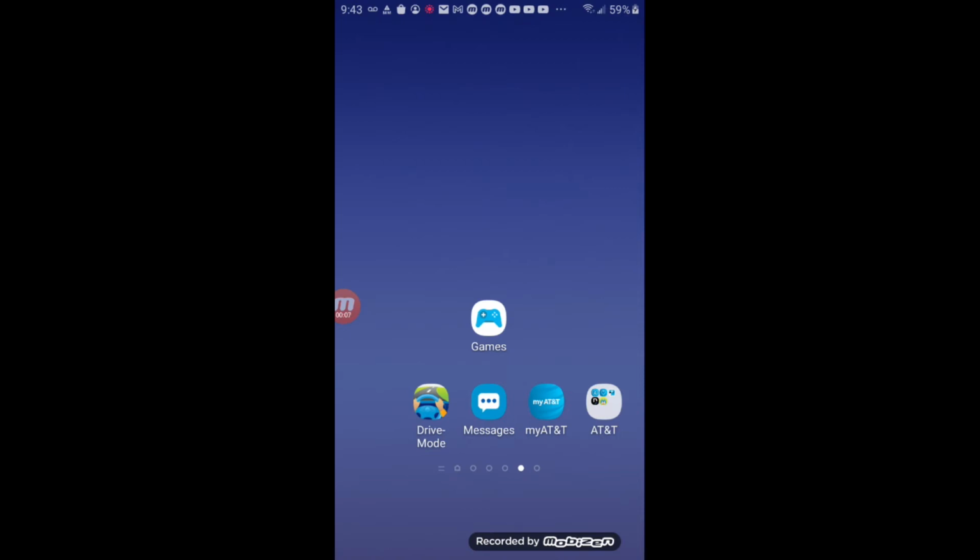In today's video, I will demonstrate to you how to download, install and use the Dilution app on an Android device. Basically what we need is an Android device like a cell phone with Wi-Fi connectivity. We must be able to access the internet from the device.